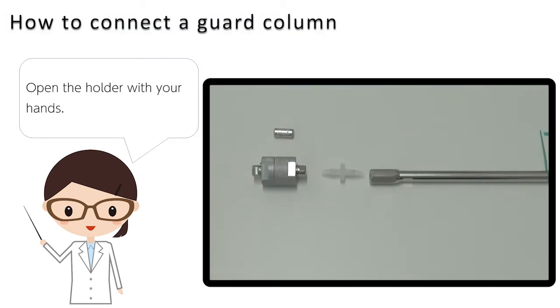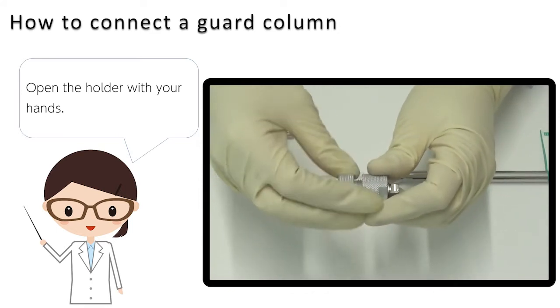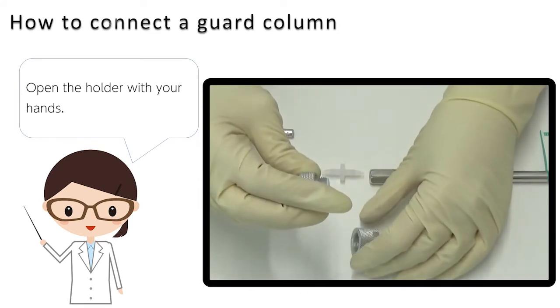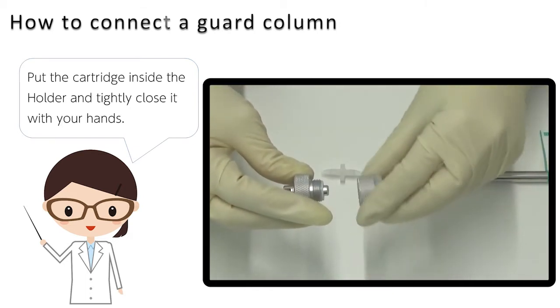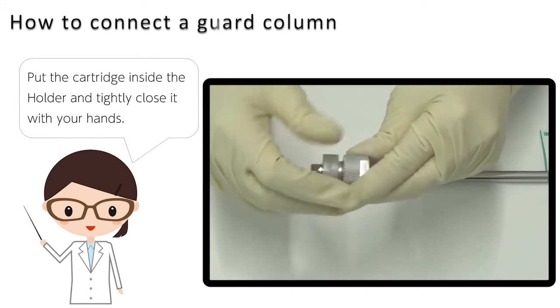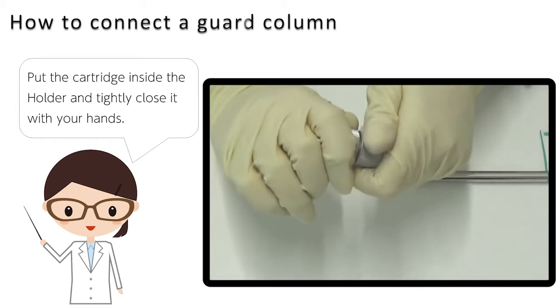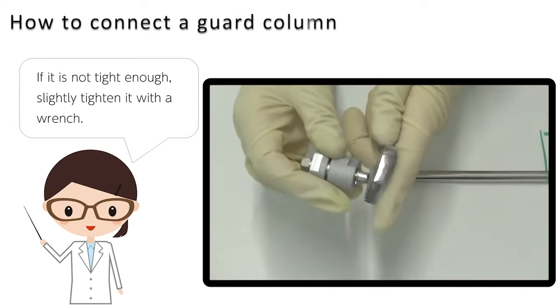Open the holder with your hands. Put the cartridge inside the holder and tightly close it with your hands. If it is not tight enough, slightly tighten it with a wrench.